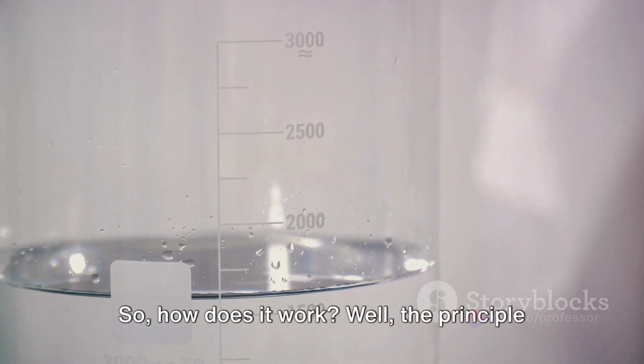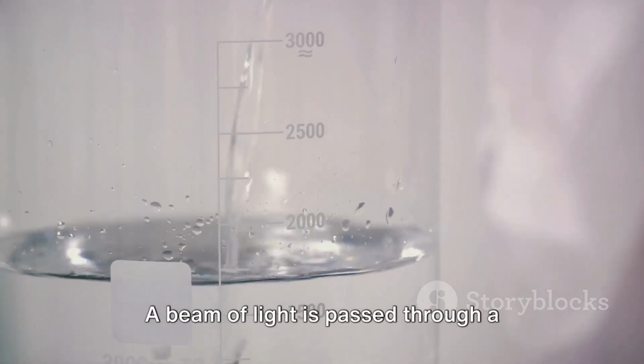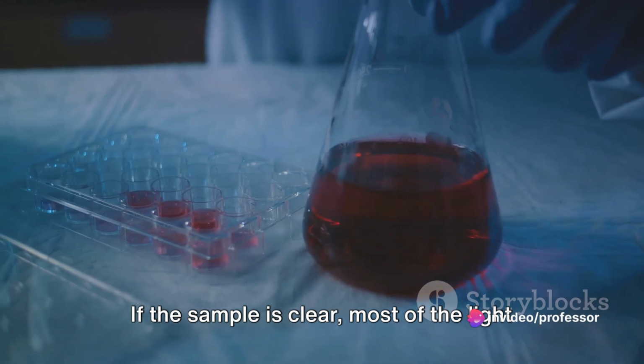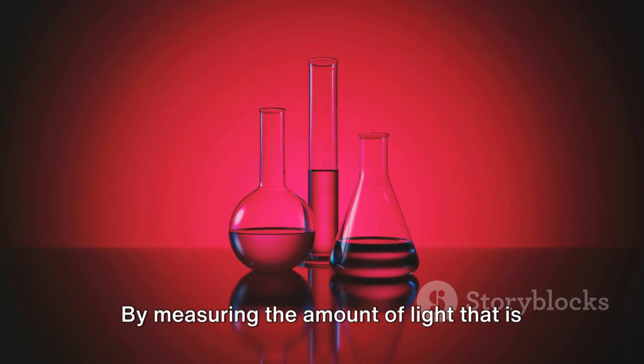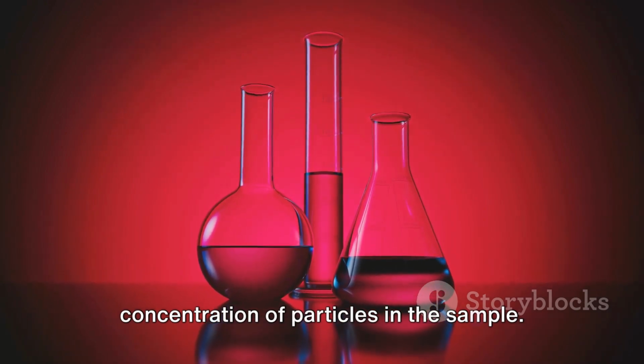So how does it work? Well, the principle behind Nepheloturbidimetry is simple. A beam of light is passed through a liquid sample. If the sample is clear, most of the light will pass straight through. But if the sample contains particles, the light will be scattered. By measuring the amount of light that is scattered, we can determine the concentration of particles in the sample.